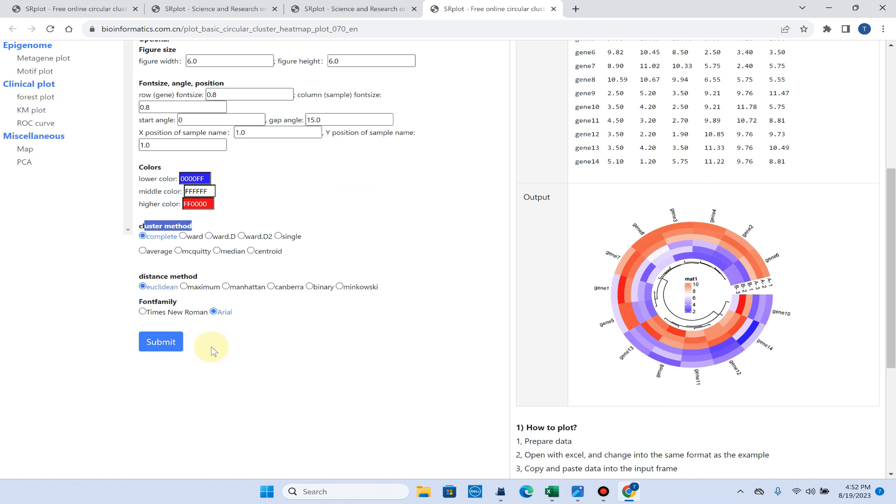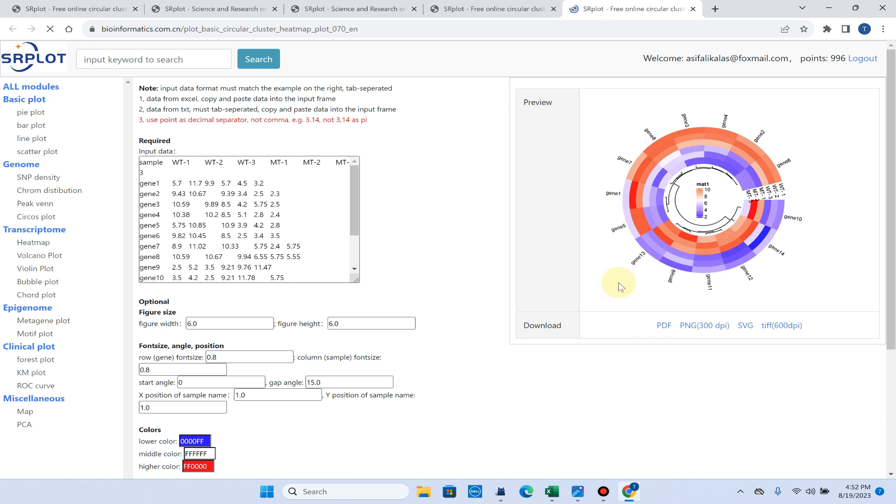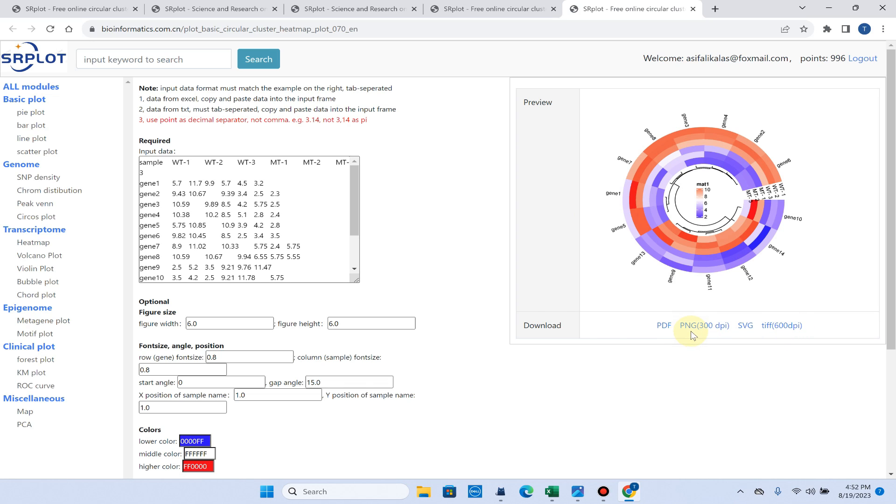I will simply click on the submit button to draw this heat map. Here you can see our circular heat map is ready and we can download it in PDF, PNG, or SVG format for free.